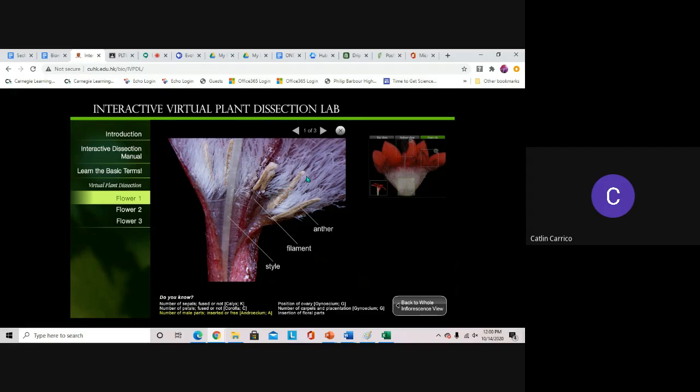So right down in here we have some hair-like structures that would help hold in pollen. And we do have some pollen spread out down through here, but here we have our male part, so we have our filament, and then our anther, and the pollen would sit here. This is the style, or the neck of the vase, that would carry up and over.